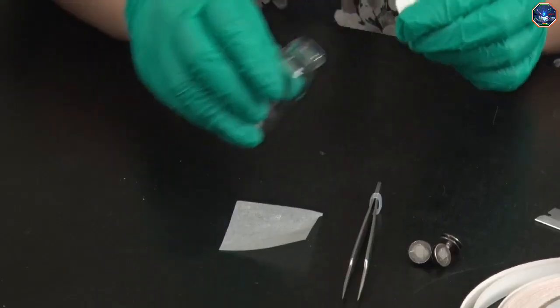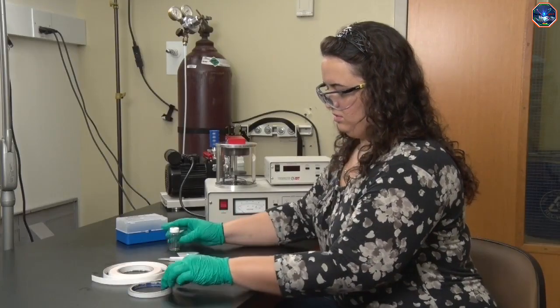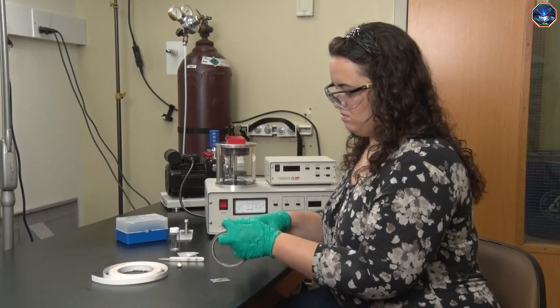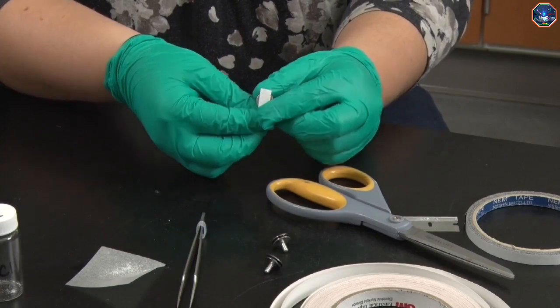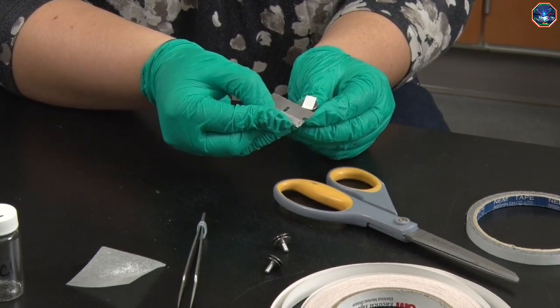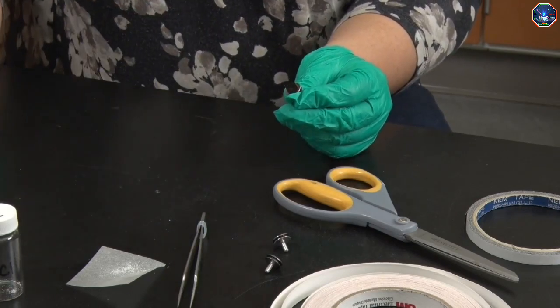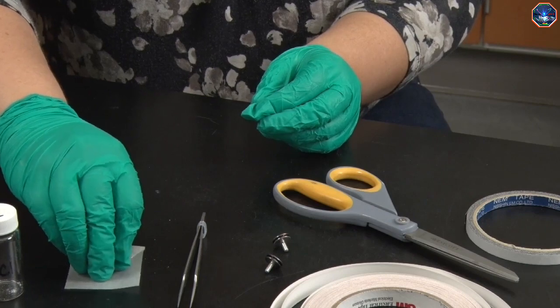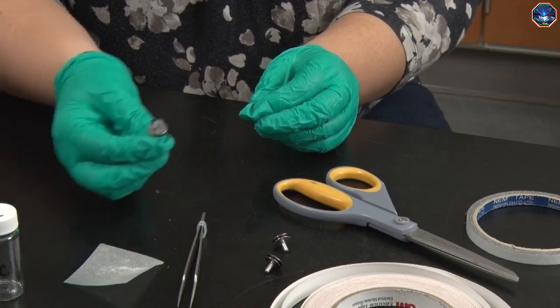First I'll mount the sample onto a sample stub with some conductive tape. The tape I'm using is double-sided carbon tape, and I'll use it to hold the salt in place. By gently tapping the sample stub on the table, I can remove any excess salt that is not well attached.